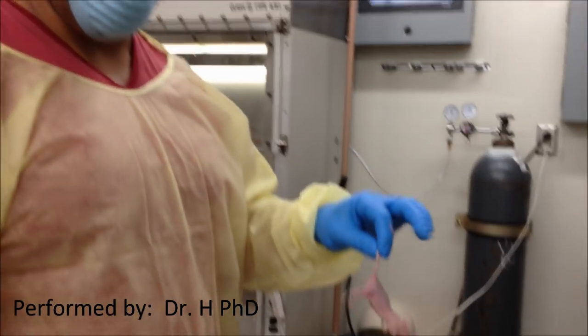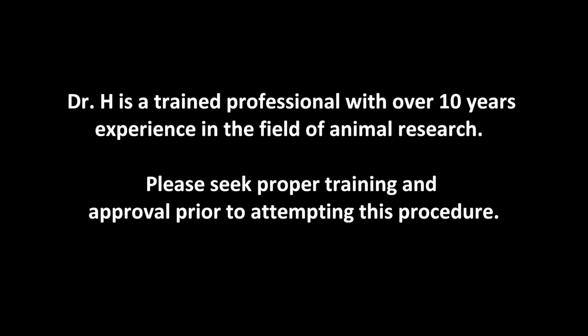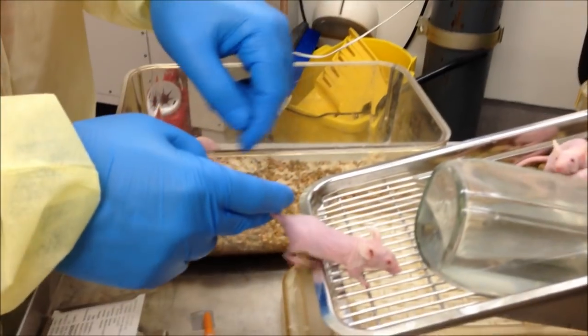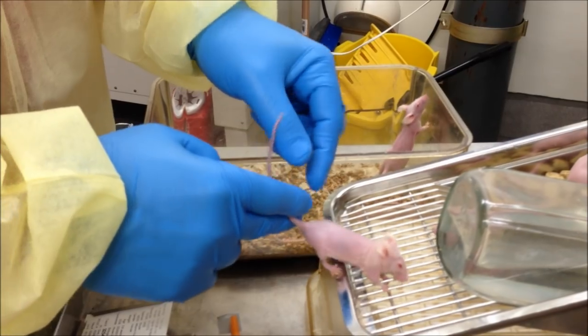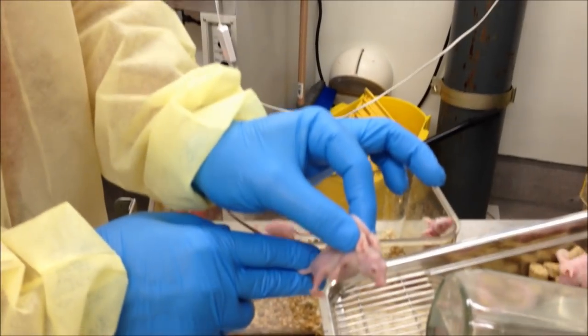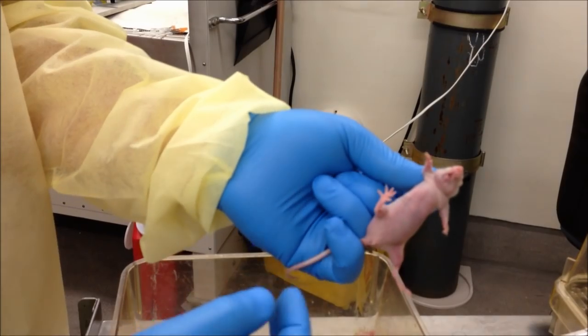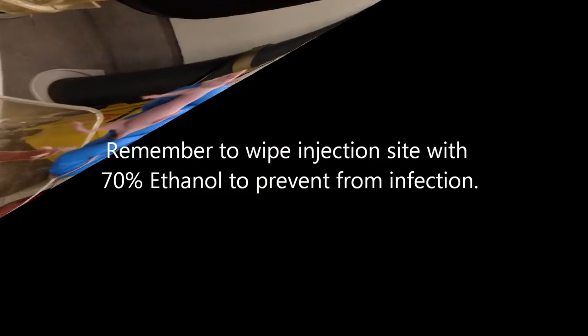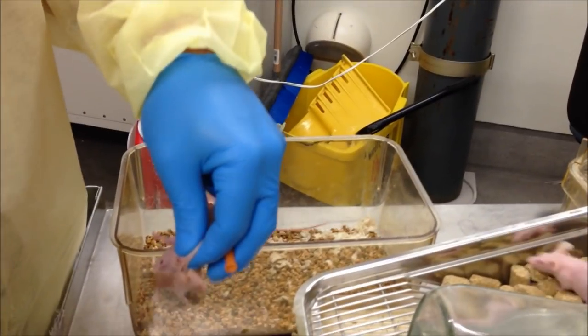Today I'm going to show you how to properly hold the mouse and inject it with ketamine to knock the mouse out. Grab the mouse's tail, use a cage and give it negative force. The mouse is going to try to go that way, so you can stabilize it a little bit. Put your fingers right on the side, get a nice grip of the skin behind its neck, and get a grasp. Tuck my fingers back, tuck my pinky just to hold the tail in place. This mouse is not going to go anywhere. This allows me to do a proper IP injection.